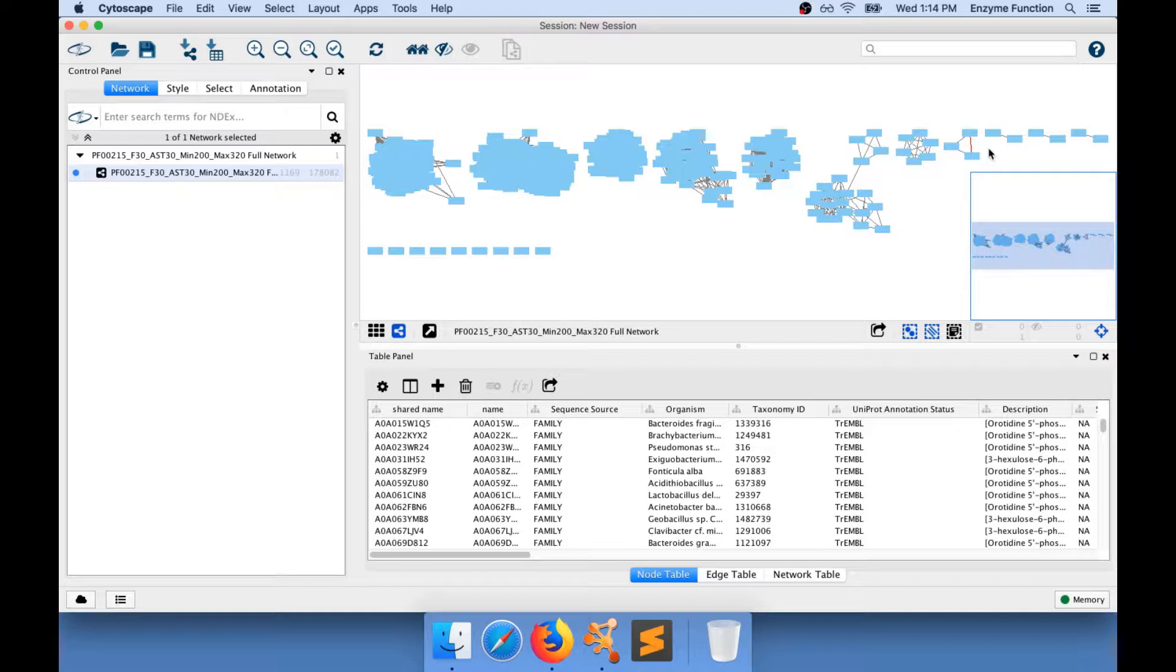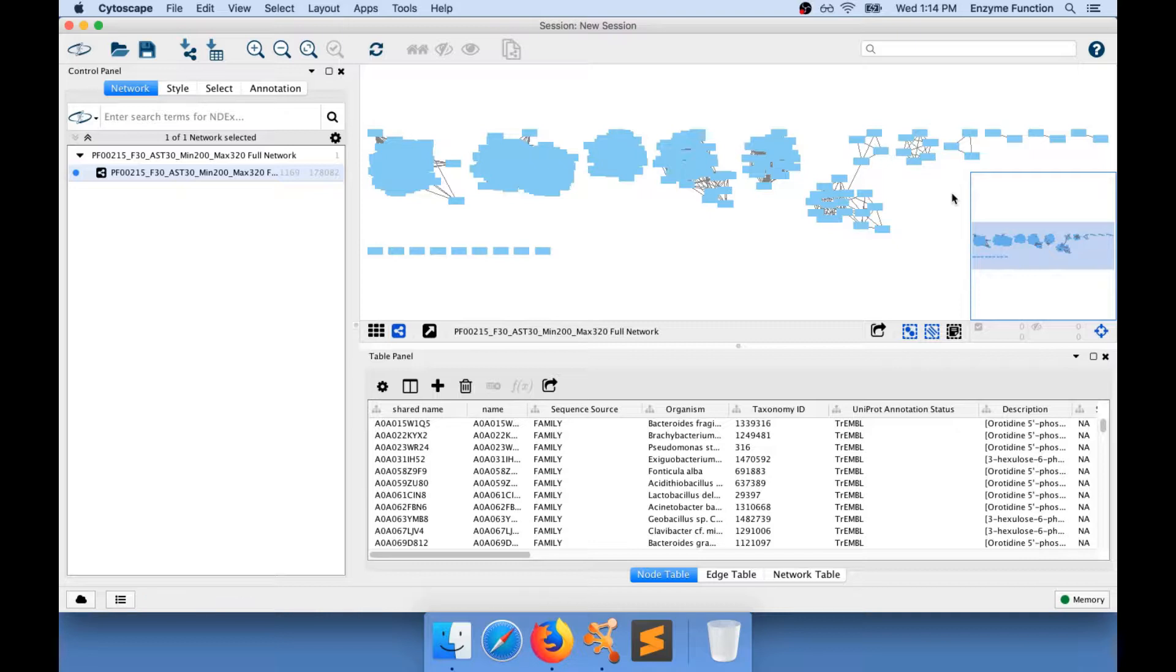You only draw edges when the similarity between the nodes is higher than the threshold you apply when you generate your sequence similarity network on the EFI website.